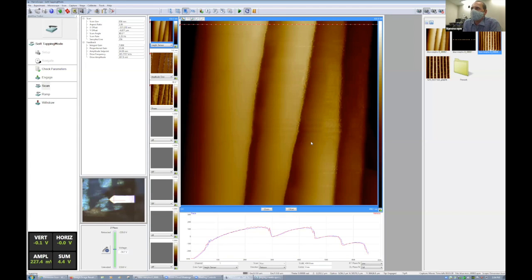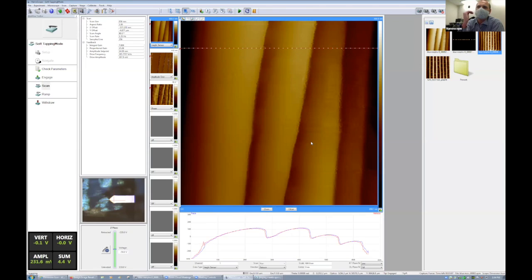But if you're imaging biological materials, your tip very often is going to get contaminated. Something's going to get stuck to it, and then it's very difficult to clean. When you're imaging things with big steps, then it's very hard to maintain very low force, because as the AFM steps like 2 microns up, 2 microns down, it's going to crash inevitably, and that tip is going to get ruined. If you're imaging hard materials like ceramics or titanium or quartz, they actually grind down that silicon tip a little bit during imaging. So it really depends what you're doing. Sometimes as little as 1 image, sometimes as many as a couple hundred, and then anywhere in between.